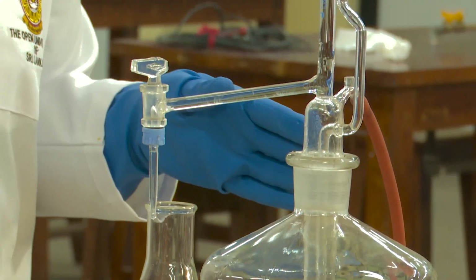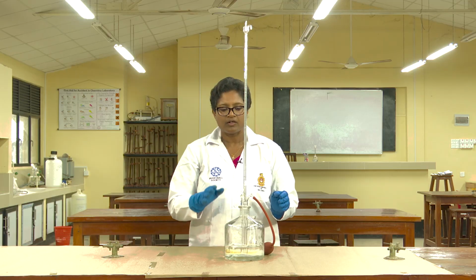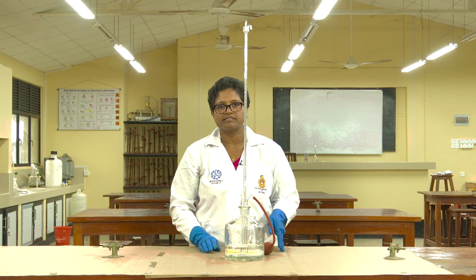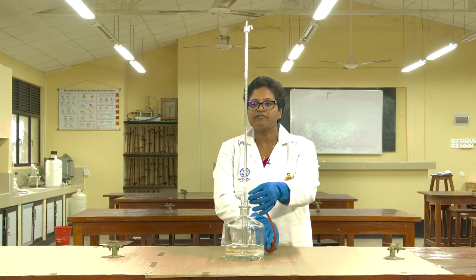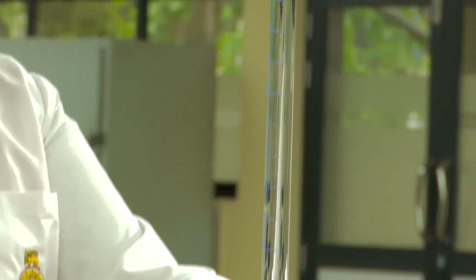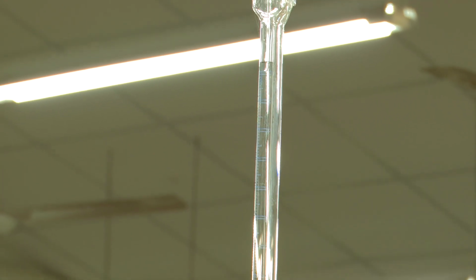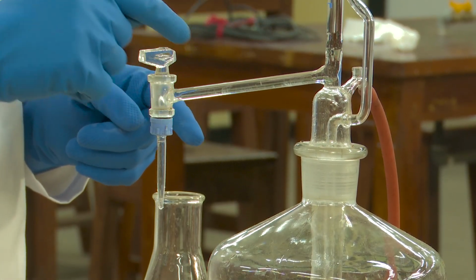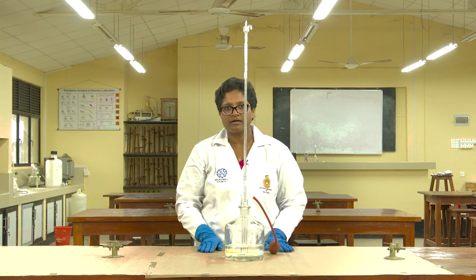Now we are about to start the titration process. This is the auto zero burette which we are going to use for the titration. You can observe here how the auto zero burette automatically brings the meniscus to the zero level. Before starting the titration, you have to make sure there are no air bubbles trapped in these tubes. And now it's about to start the titration.